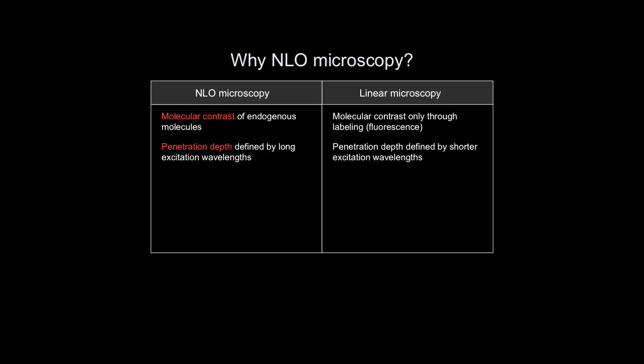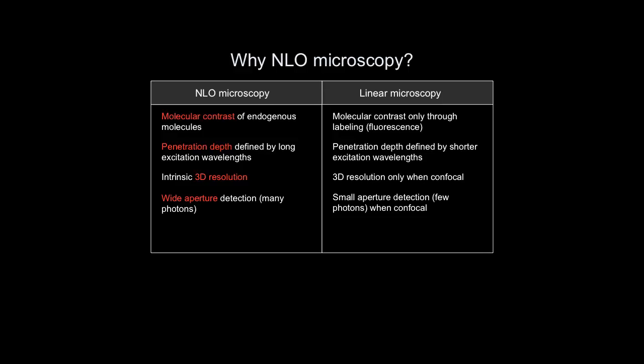We talk about increased penetration depth due to long wavelength excitation, and intrinsic 3D resolution because of the nonlinear dependence of the intensity. We have wide aperture detection, so we collect many photons. They are more photons than in the linear microscopy, so it's really a more efficient way of detecting. And then we get photodamage only in focus.